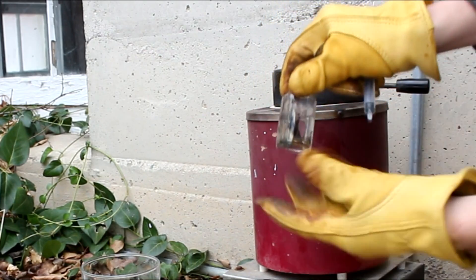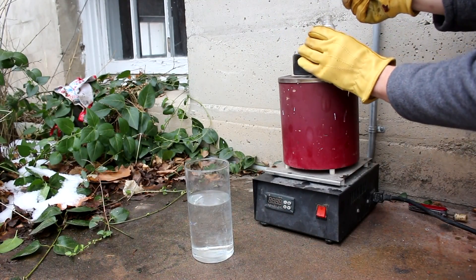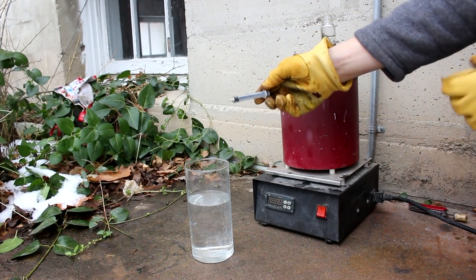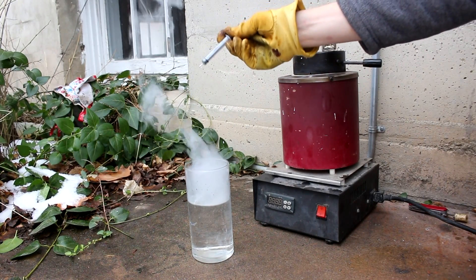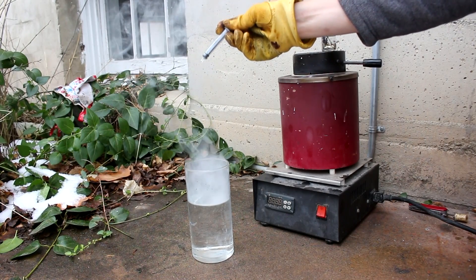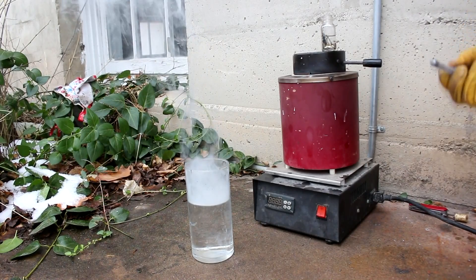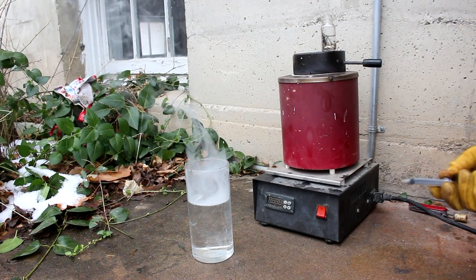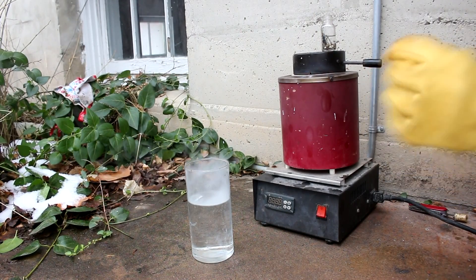Now the cesium is liquid. Let's pull a little bit out of there and drop it into water, shall we? Here's a little bit of the cesium metal. It's fairly reactive. There's some tiny drops. It reacts quickly. It doesn't release a whole lot of energy but the reaction is very fast.